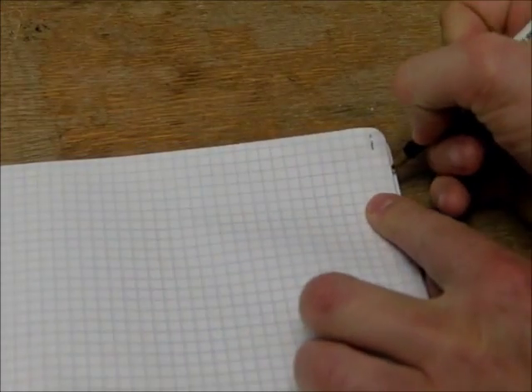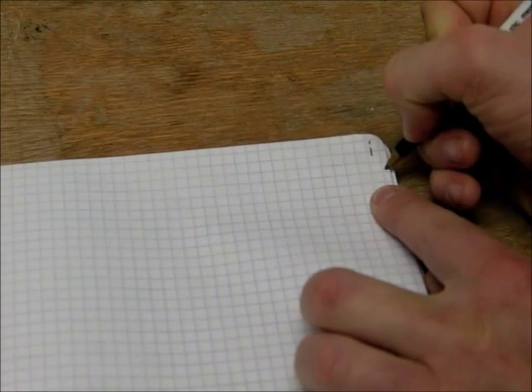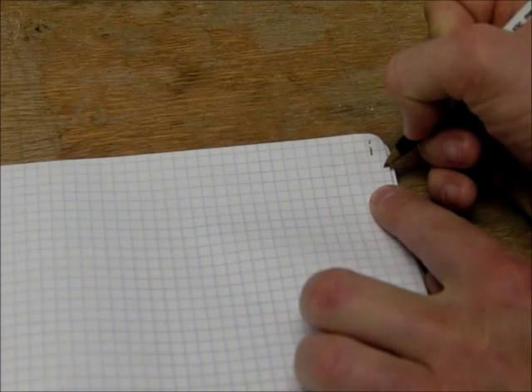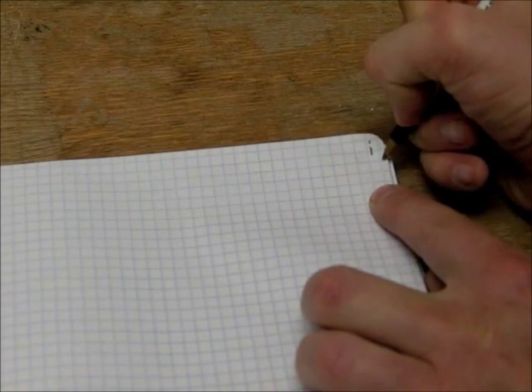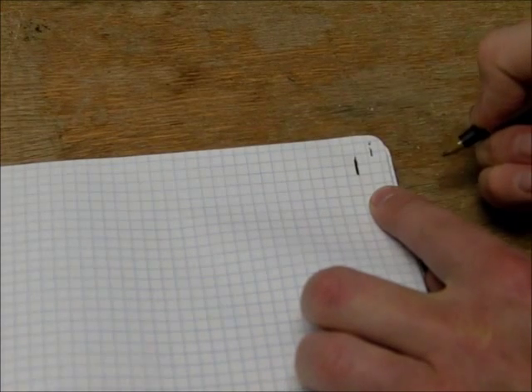Now that you've had a chance to page number the entire book, we are now going to set up the table of contents. Regardless of whether you're left-handed or right-handed, start from the right-hand side of the page and count in three squares. If you want to consider this little sliver three squares, that's up to you. It does not matter to me. So here is my tick mark for three.